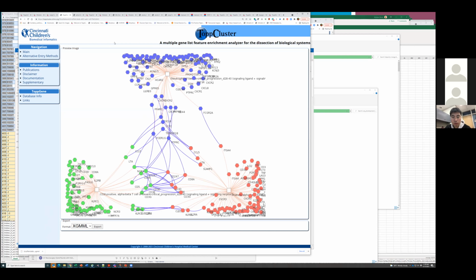There's the angle of how these genes actually work together in this host defense function from the neutrophil side, or forming an intercellular network where you get a cascade of activation of cells that are then working as a team to fight the infection, and what are the consequences of that, and then how does that differ between individuals that only had a mild degree of infection, or individuals that became critically sick and either died or needed ventilation, that sort of thing.